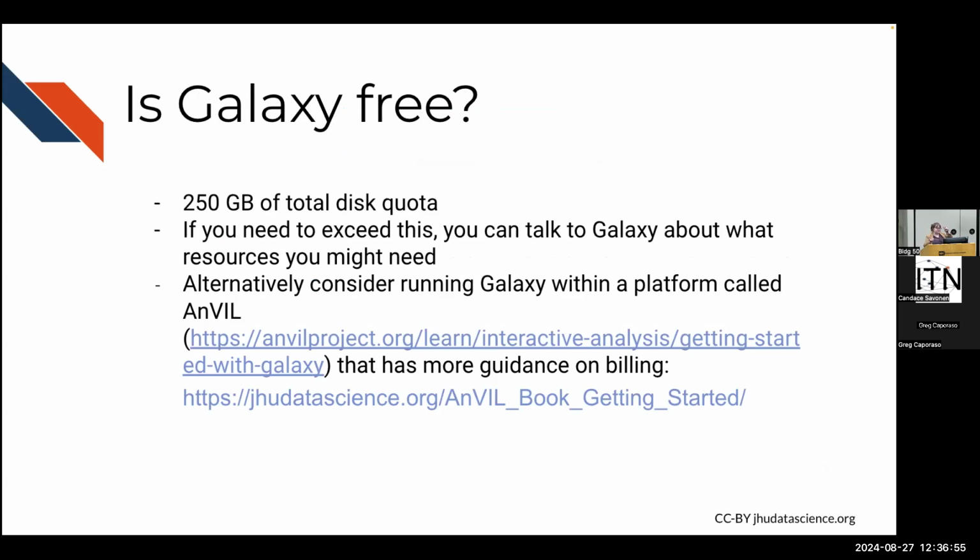So as was mentioned earlier by, I want to say, definitely Candace, possibly Carrie too, because we love talking about this. If you have PHI or PII and you need it to be protected, Anvil's a good thing to look at. And so if you need an alternative to Galaxy, Anvil has similar help forums and guidance on how to get started there.